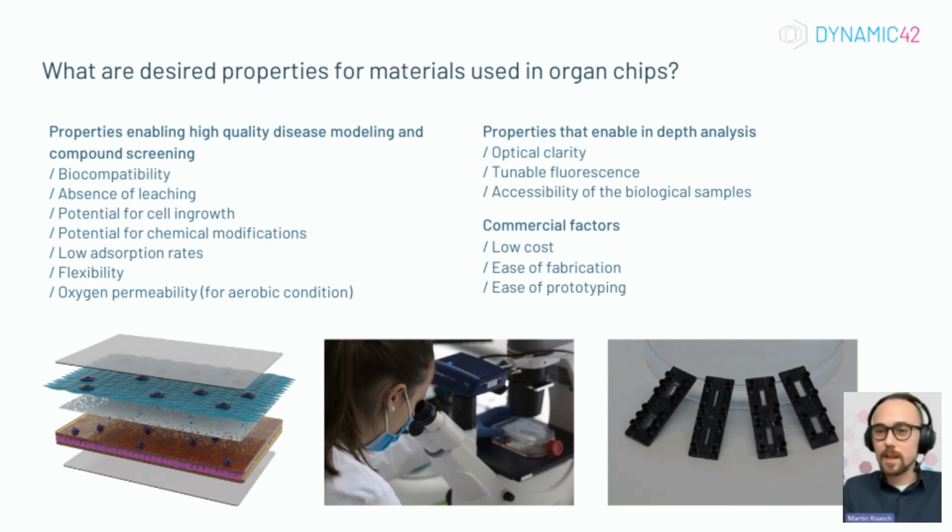Maybe require some samples beforehand and do some own tests if you do not find something in the literature about biocompatibility. Then you should also check if the material leaches into your cell culture. If polymers, especially soft polymers, can be set free and start to interact with your cells, that can have a negative influence on them.